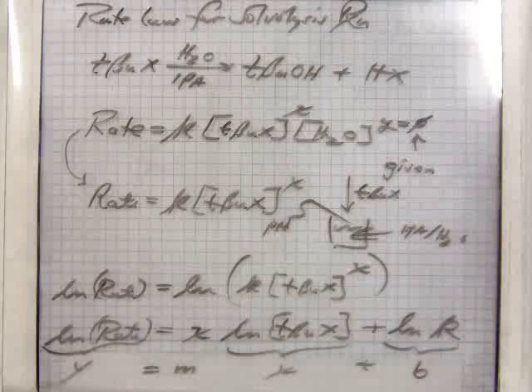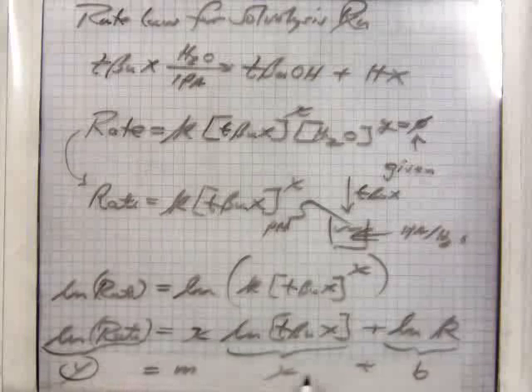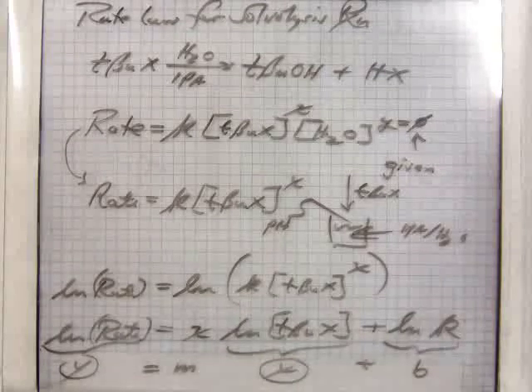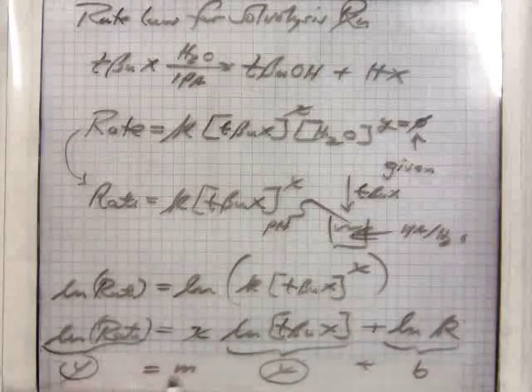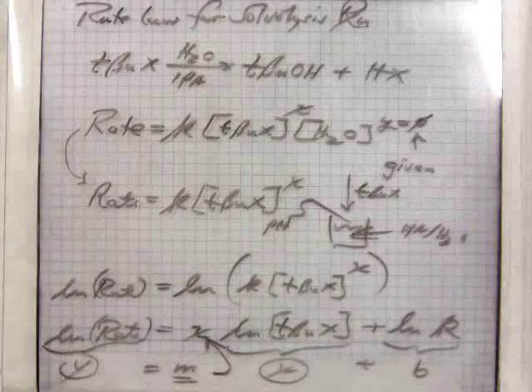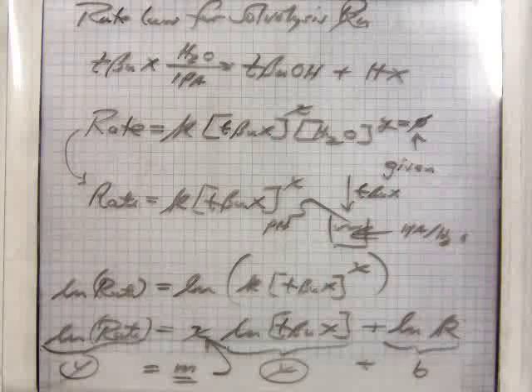And so that's what your objective is in this experiment, is to get the x and y out of this, plot them on 2 dimensions. You go online, you'll see that plot page on there, and determine whatever the slope is. Once you get that slope, you'll have the order of the reaction. Then once you get the order of reaction, you go back in and get the K value. Like that.